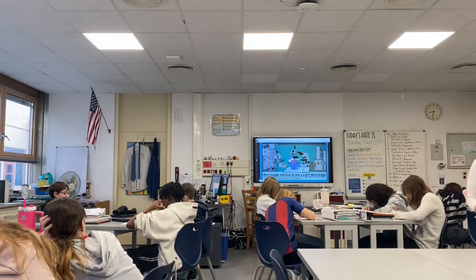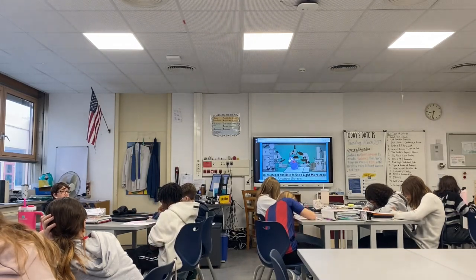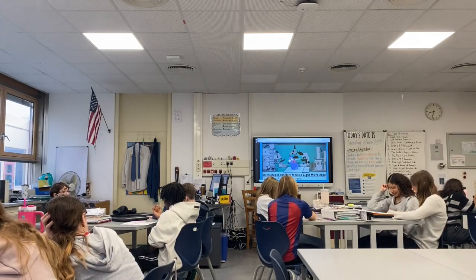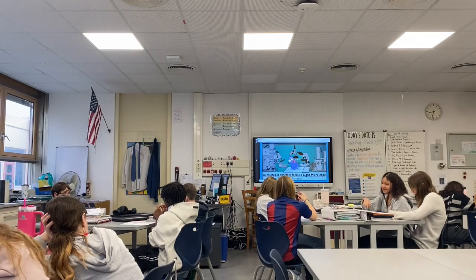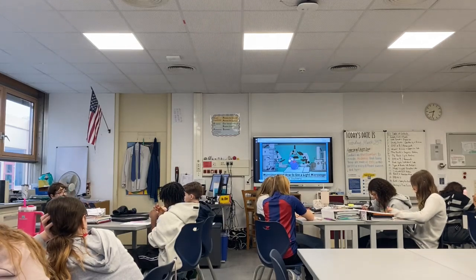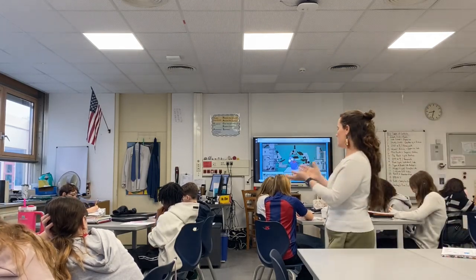And then resolution. So resolution is a little bit different. What is resolution? Somebody got it. Yeah, Maya. You like distinguish the thing. Okay, Cabs, you want to help her? Resolution makes things easier to see. It makes it clear. Yes, exactly. Resolution clarifies your image, so it makes it clear.